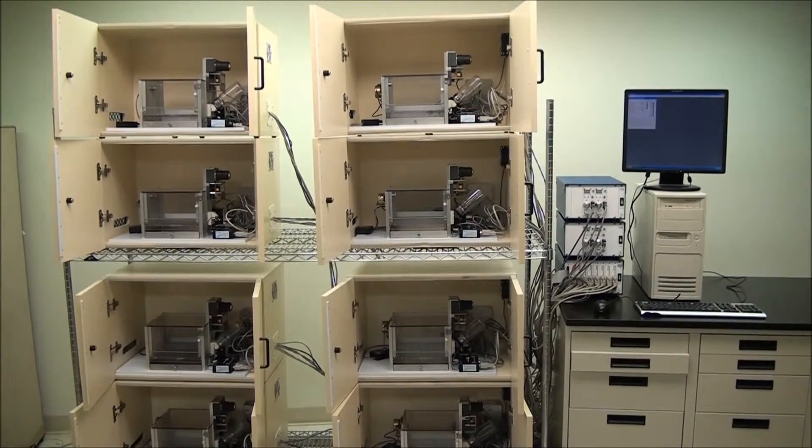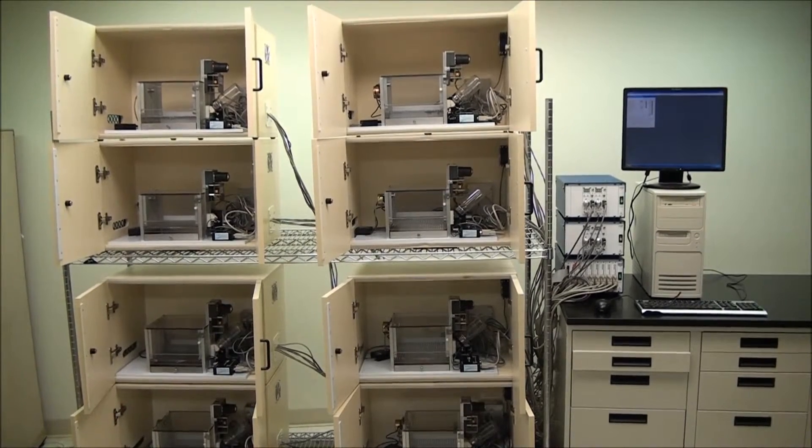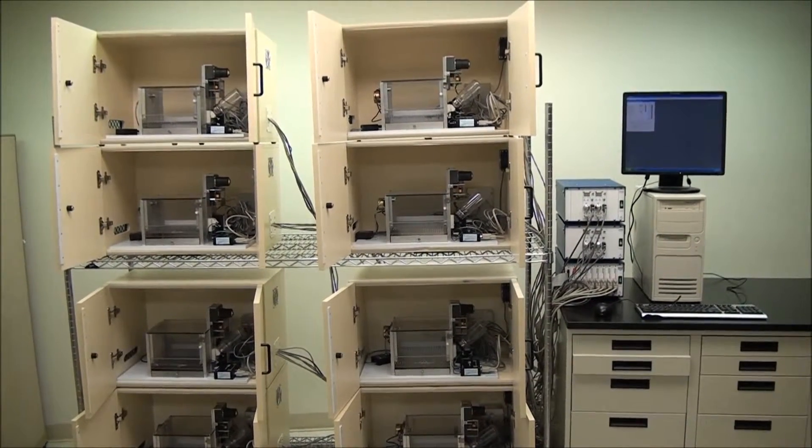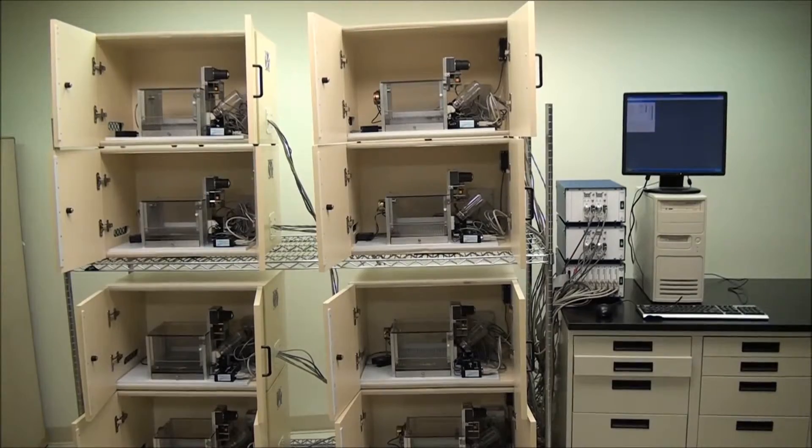Hi, this is Rich from New Life Scientific, and today we have a Med Associates Stimulus Response Chambers for mice, and these have the Licometers and the Grid Switch Scrambler included with them.